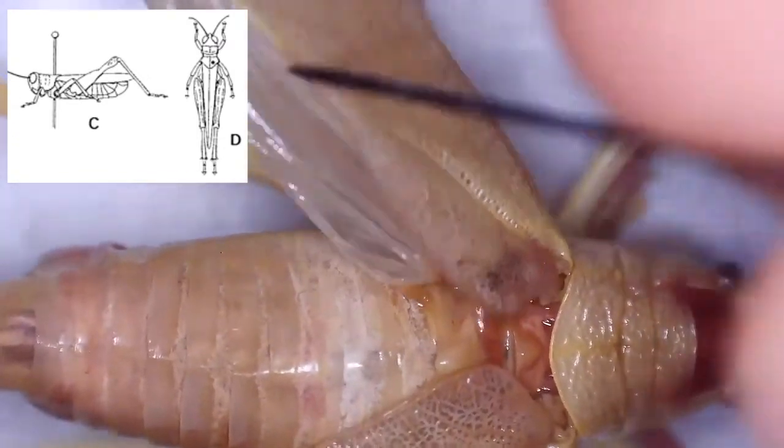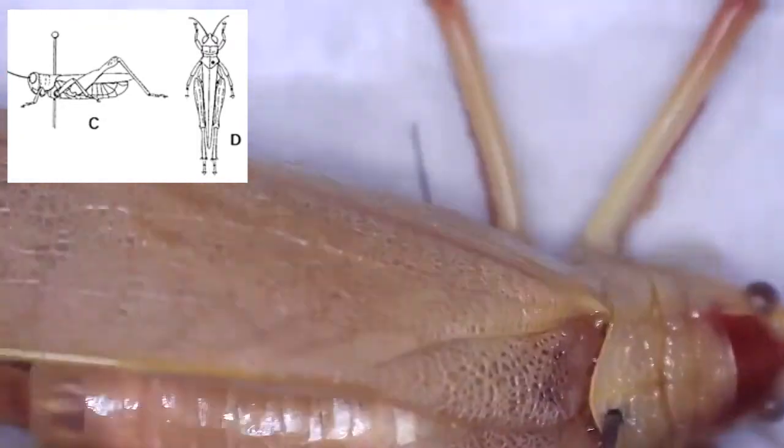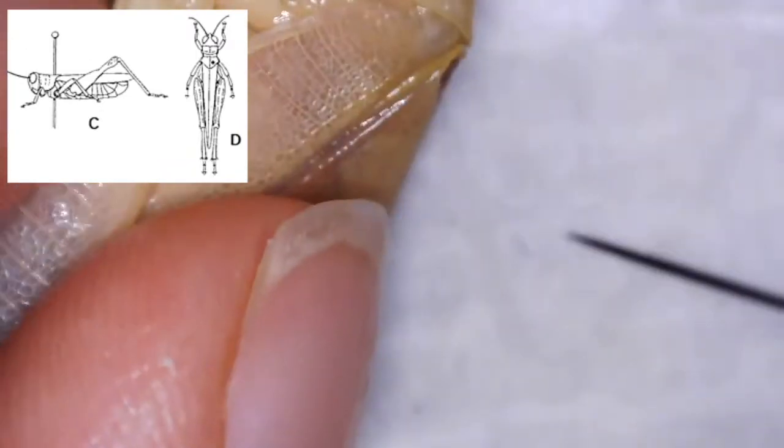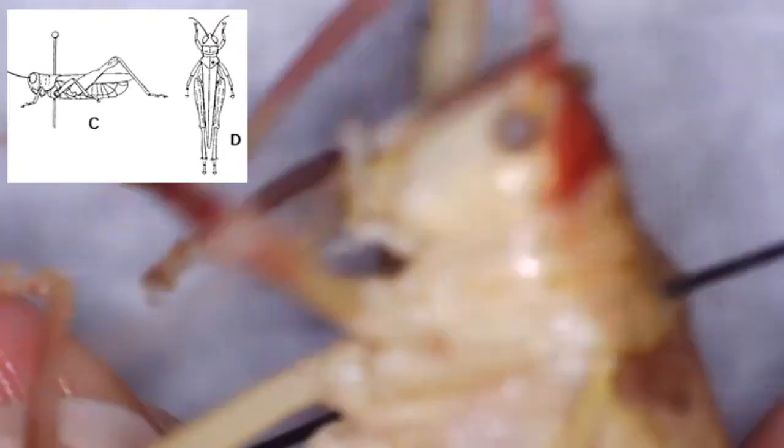Now I'm just withdrawing the wings here to show you where the abdomen is. You don't want to pin through the abdomen. You want to go in that pronotal plate right there as I'm doing. And I'm straightening it out, it's definitely not a 90 degree perpendicular, so I'm straightening that out and getting that to the right angle to the insect.